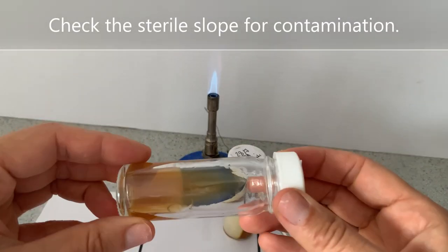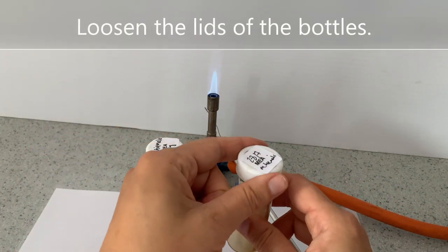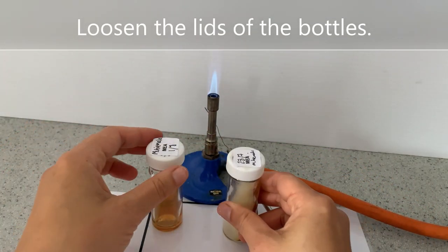Check the sterile slope for contamination. Loosen the lids of the bottles.